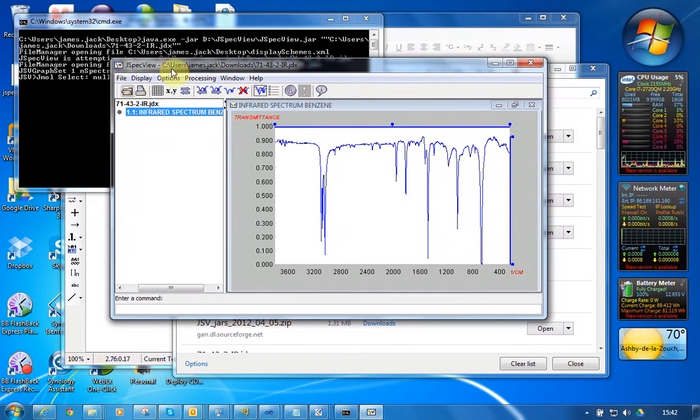Obviously, I could improve the way that this is working. I may modify it so it's launched as a process, in which case I'll have more control and we won't get this other window popping up. I'll see. But I just wanted initially to do it using file associations. So that's in the case that the link you've got to the ChemSpider Spectra actually points to the Spectra file that you could then download.